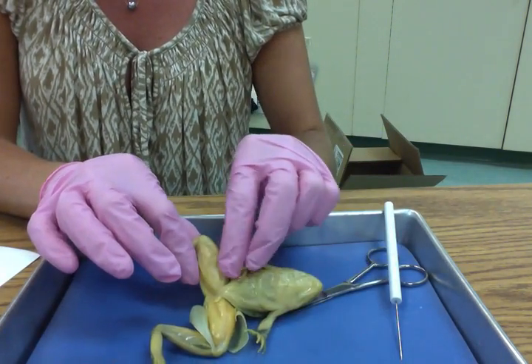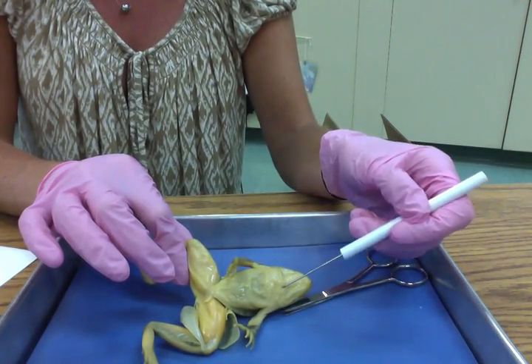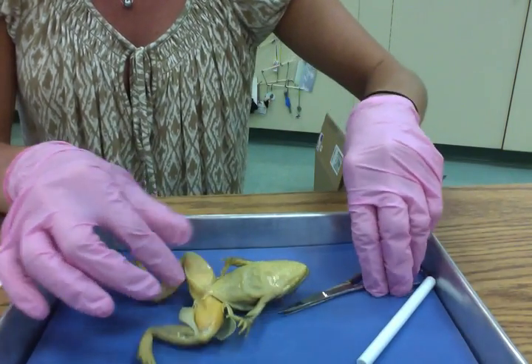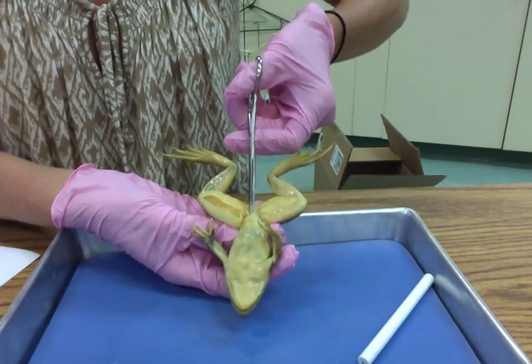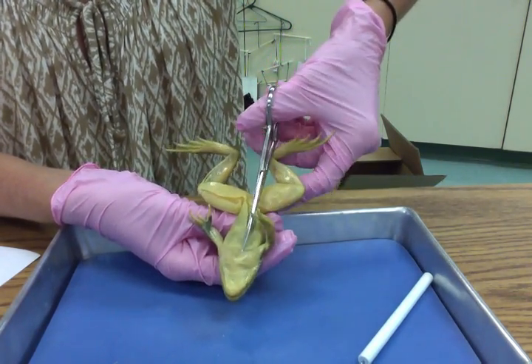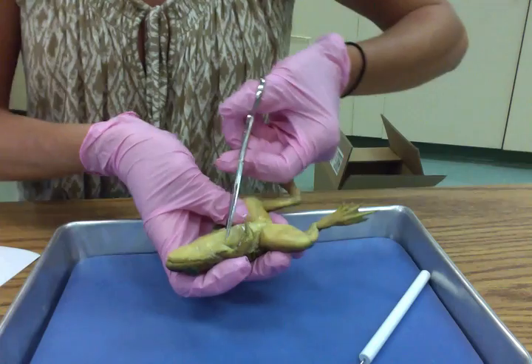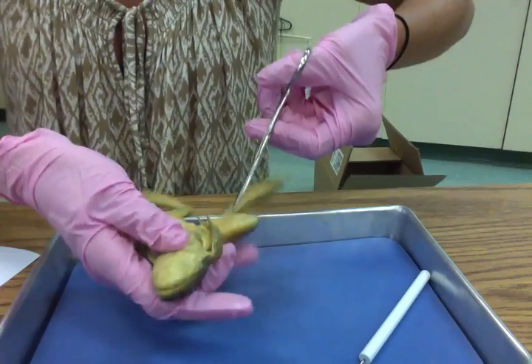Next, we're going to open up the body cavity of the frog. The body cavity is just this hole in the center that holds all of the internal organs. So what we're going to do is cut straight up like that, and then over towards the armpits. Then we'll peel the skin down. I'll cut like this so you can see. So cut straight, get under that flap of skin again. You can use the hole that we did for the legs. And you're going to cut straight up towards the mouth, and then down towards the armpits, and then over down here by the legs, we're going to cut over towards the side as well.